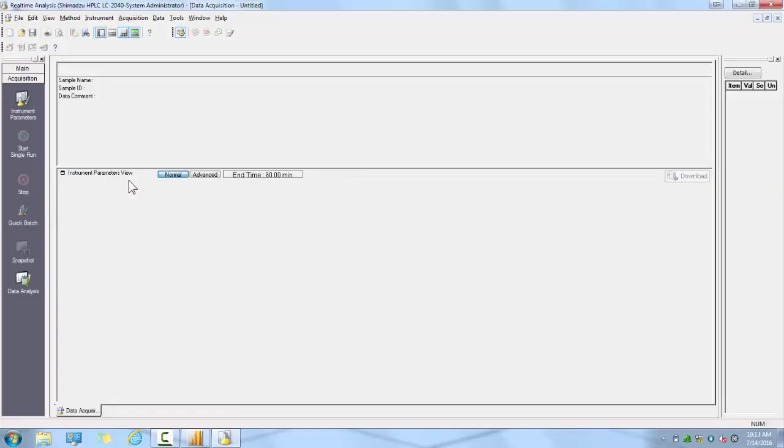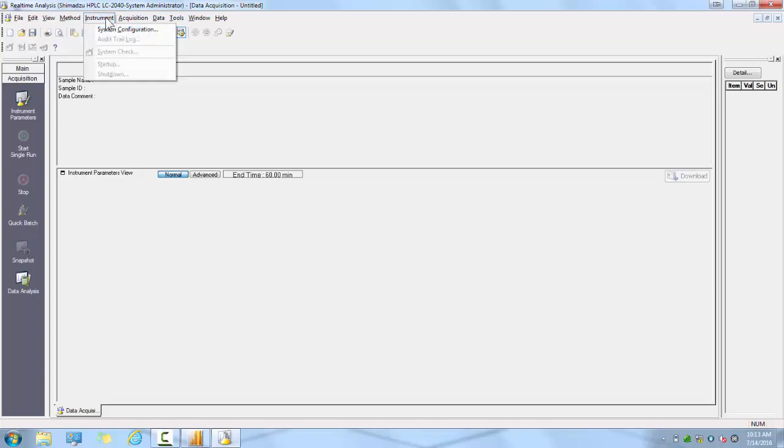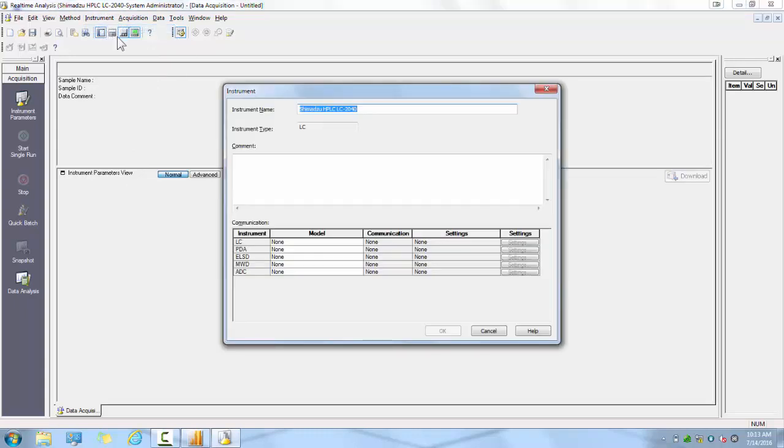Once real-time analysis is opened, you will see a blank chromatogram view screen and a blank instrument parameters view screen. To configure the hardware of your instrument, go to Instrument, then select System Configuration. The screen that pops up is the Instrument Setup and Communication Settings screen.